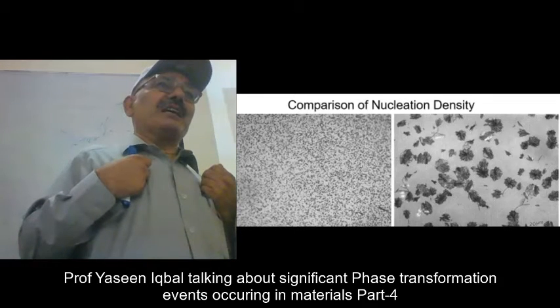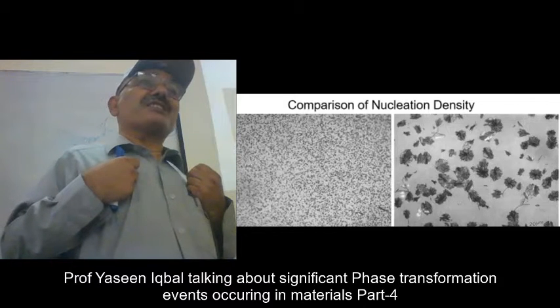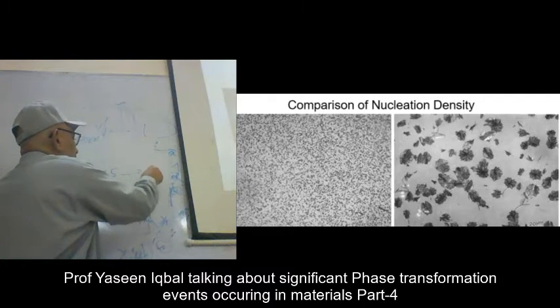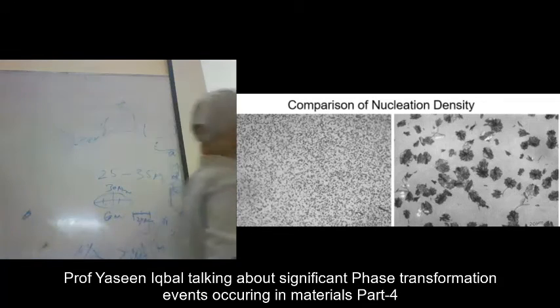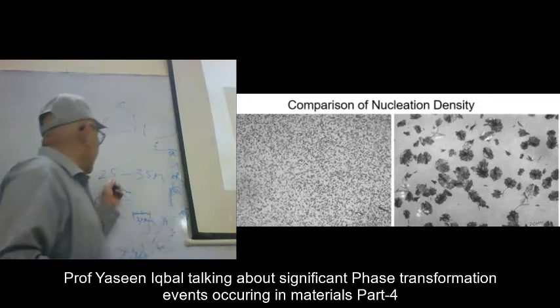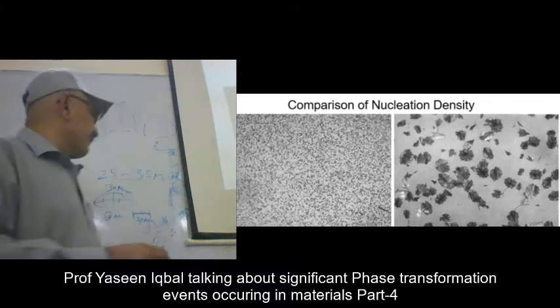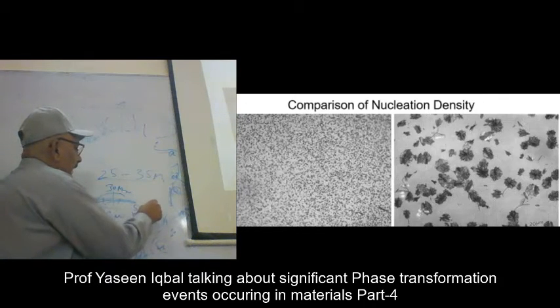But my opinion is, as a microscopist, always write the shorter dimensions of the crystals ranged between, for example, say 25 and 35 micrometers. Because when you measure the dimensions of several crystals and you are averaging it, then you say the shorter dimensions of the crystals range between 25 and 35, and this range between 55 and 65.